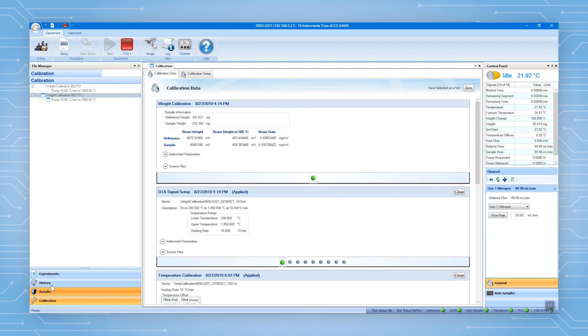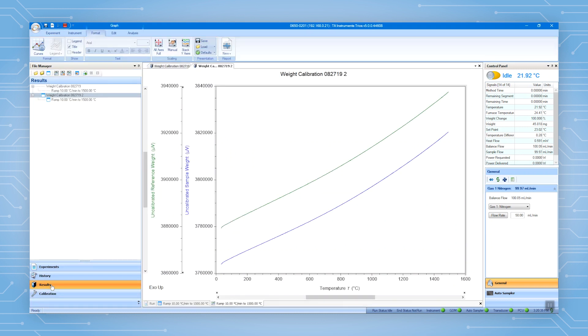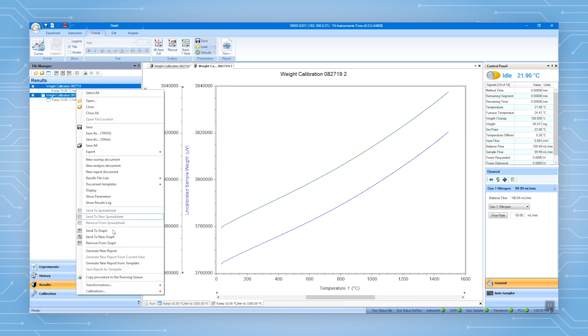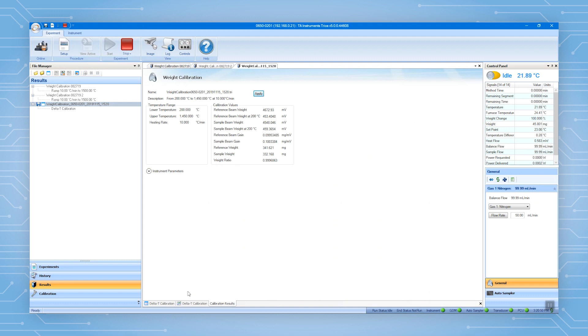You can also analyze the calibration data manually. Open the two files that are associated with the two calibration runs. Select both files, right-click, go to calibration, and select weight calibration. Then apply the calibration data.